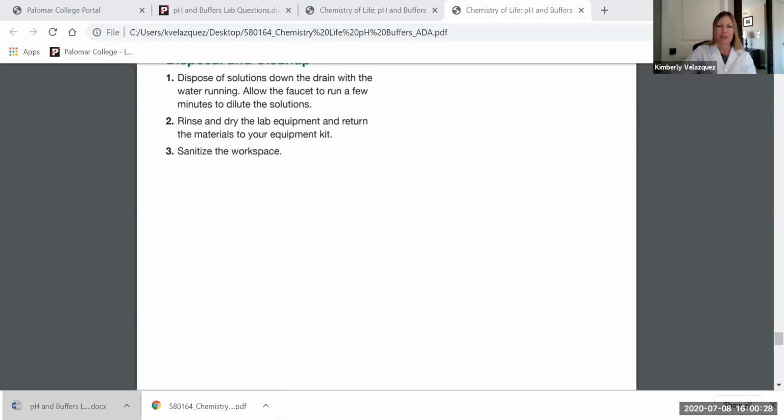These are the same calculations that are in the example of the lab exercise. You're going to, again, be doing a different calculation because you're going to be calculating it for 12 milliliters for the actual lab exercise. This is where you'll record your data. This is your explanation of what happened in activity 1. And again, be sure to take a picture because at the very end is where you're going to put your photos of all 3 parts of the experiment. So this says insert a photo of your results of activity 1.